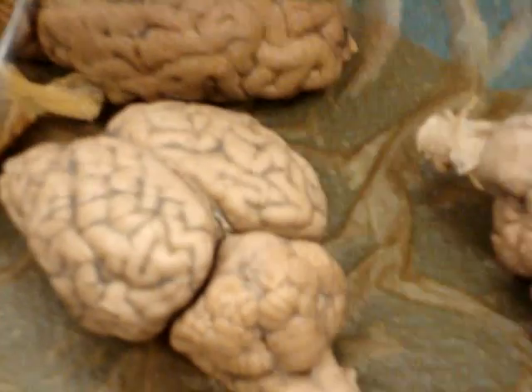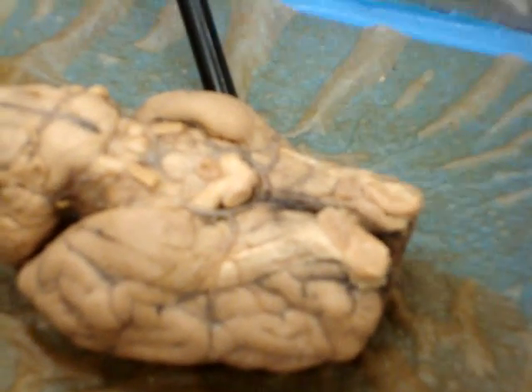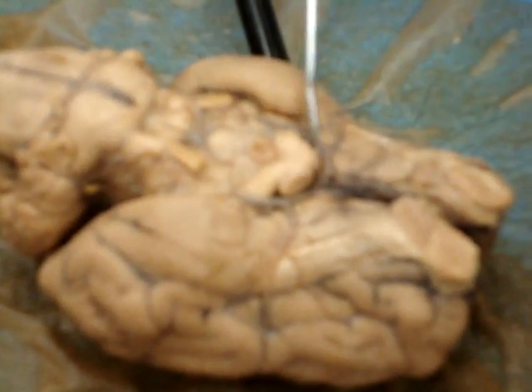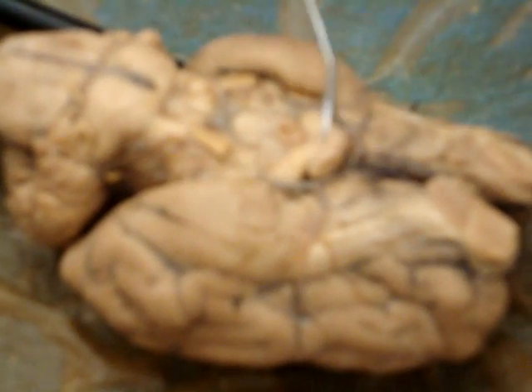Okay, so that's from the top. Let's get it from the bottom. What nerve is this? Olfactory. There are tips of nerves right here. What are they? Optic nerve. What do you call this little spot where they cross? Nope. The spot where the optic nerves cross. Optic chiasma, right.